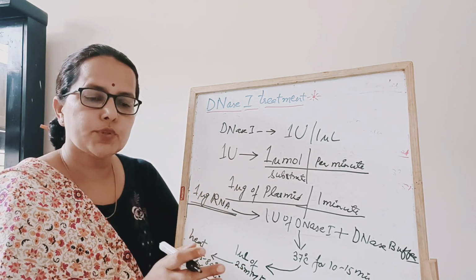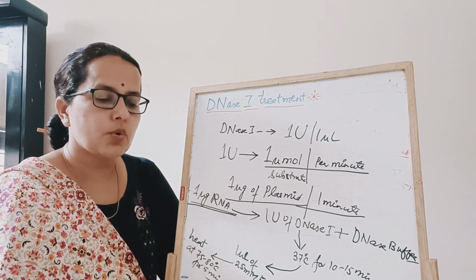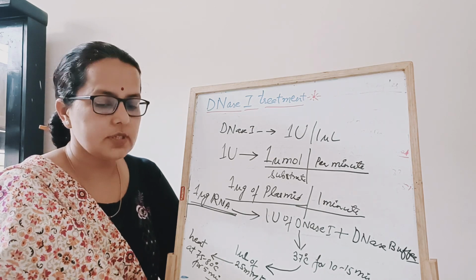You have to include it in your protocol if you are going with any gene expression studies.